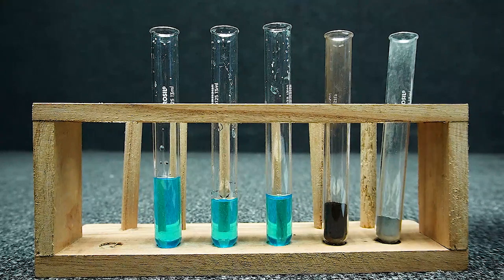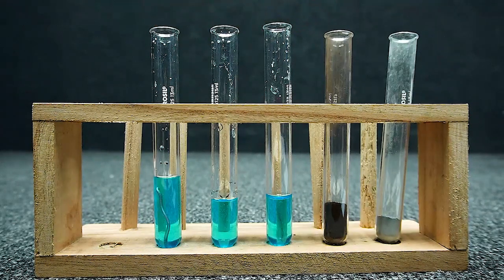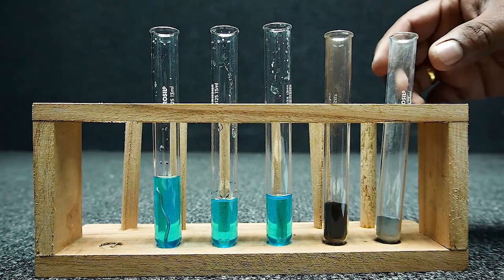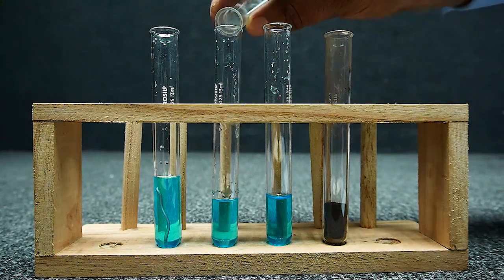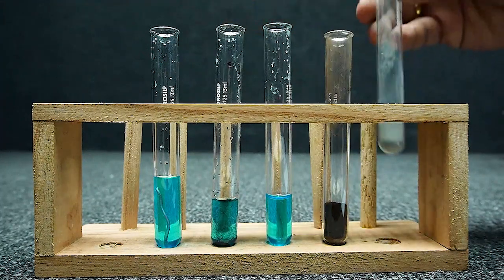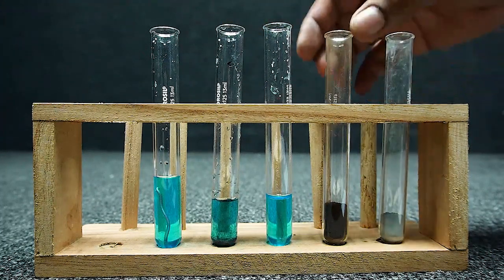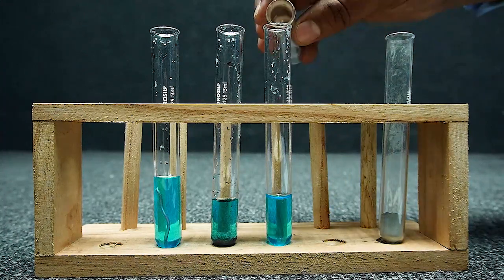Reaction of copper sulfate with aluminium. Reaction of copper sulfate with zinc. Reaction of copper sulfate with iron.